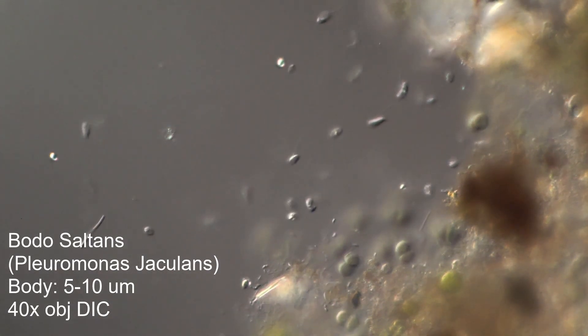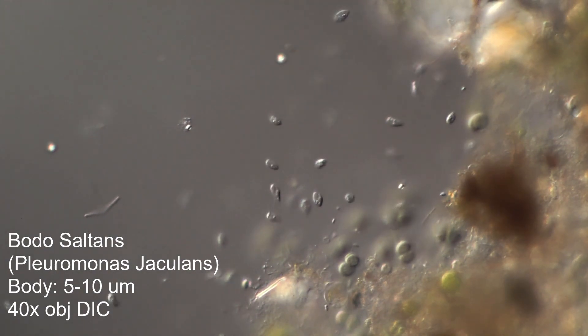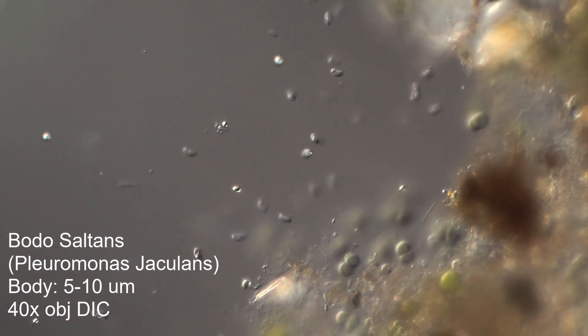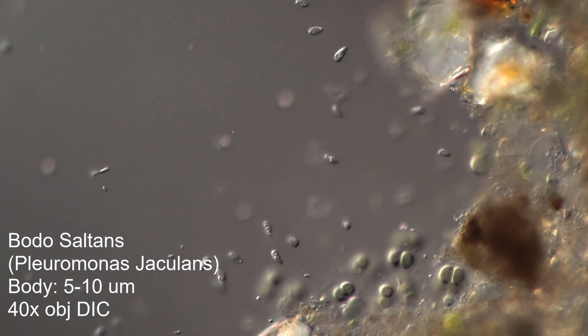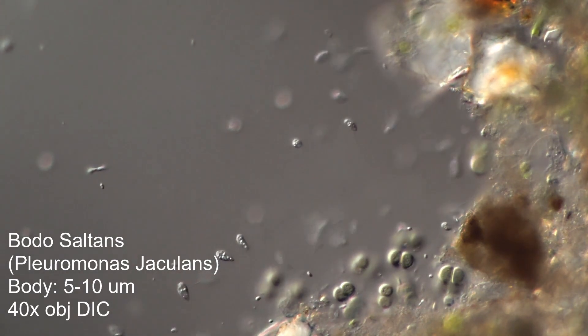What's really frustrating is there are so many little tiny flagellates that you see that you just can't identify. So it's nice to have a flagellate that is easily identifiable from its characteristic motion. These are Bodo saltans, about 5 to 10 micron body length.